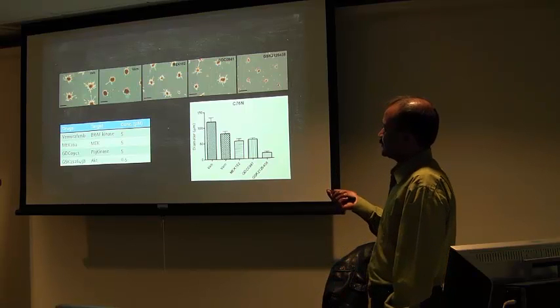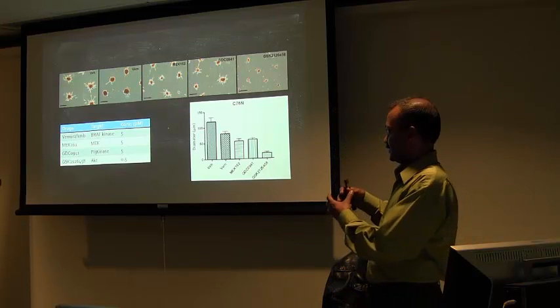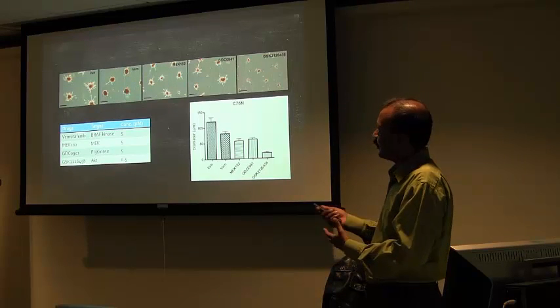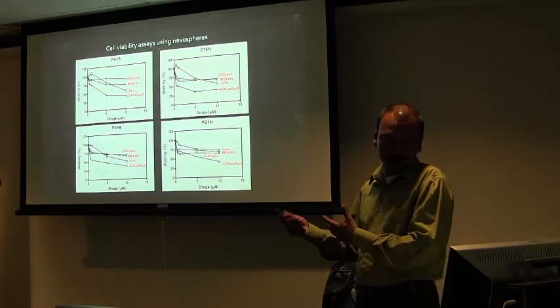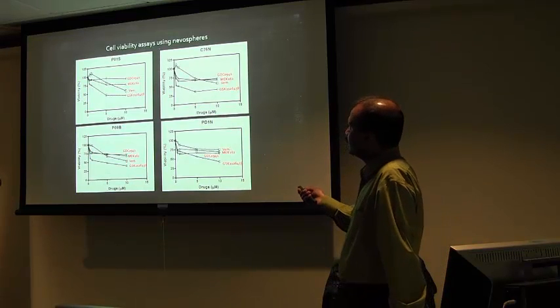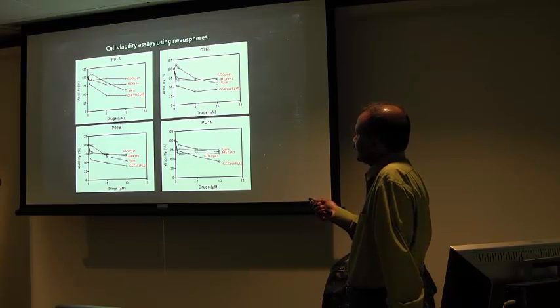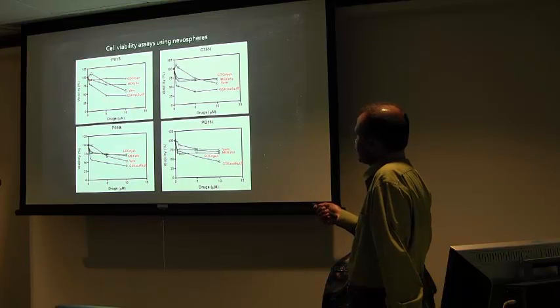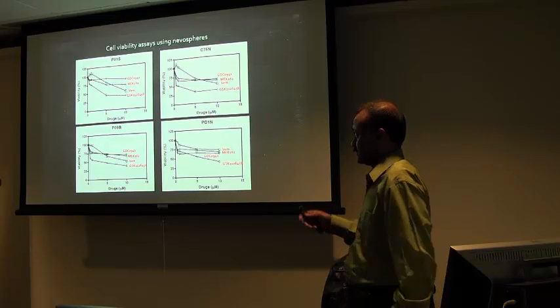So these kinds of studies will give us more reliable data about a drug action, because it's working on the spheroids like in the in vivo environment. So we are working more on this. This is just preliminary data, and we hope to find out more. These are some cell viability assays you can do using the spheroids. The same drugs used here, different patient samples, different spheroid cultures, and GSK turned out to be the best one in every case, although there are some patient-specific differences.